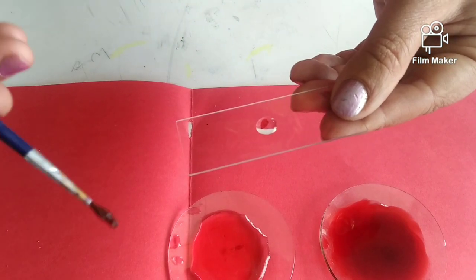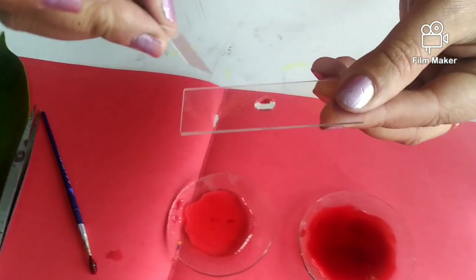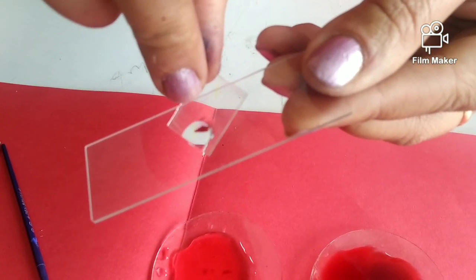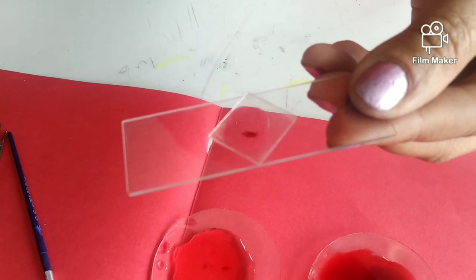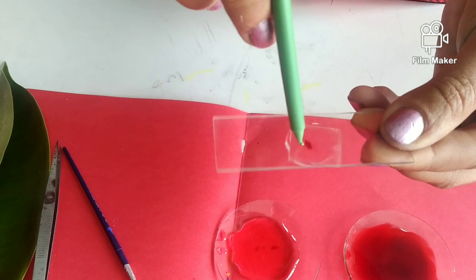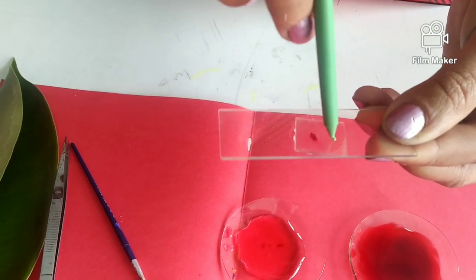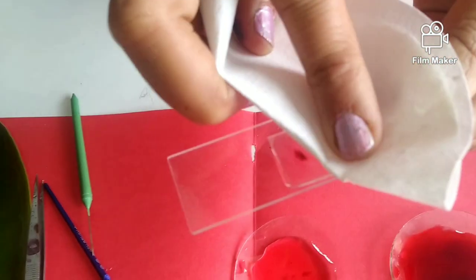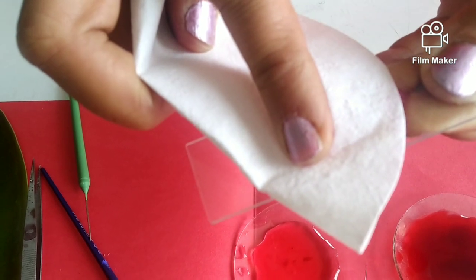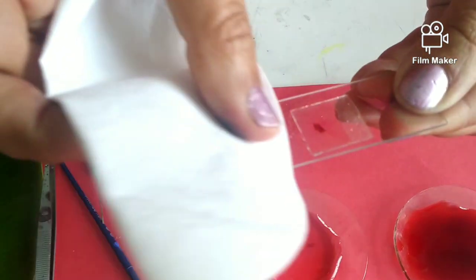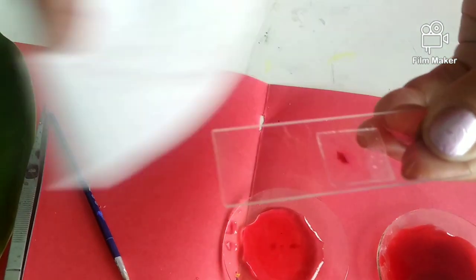Now place it over the glycerin on the slide. We will put a clear cover slip over it gently using a needle. Sometimes air bubbles can enter, so the cover slip needs to be placed in such a way that air bubbles are avoided. Excess glycerin and stain can be removed using blotting paper. This will absorb the extra stain as well as the glycerin.